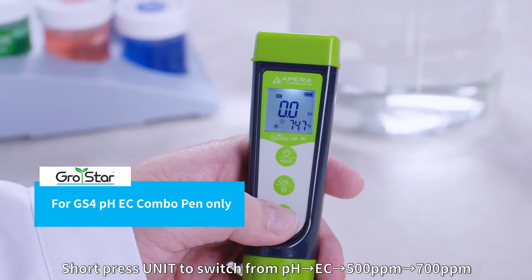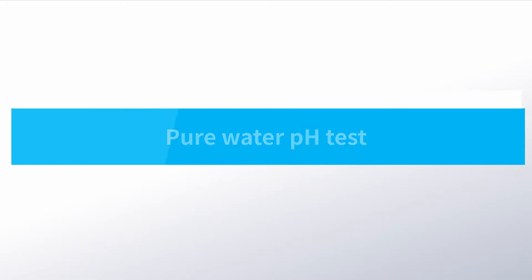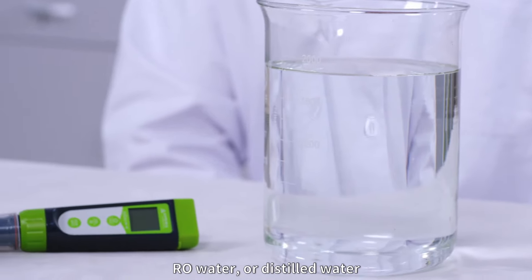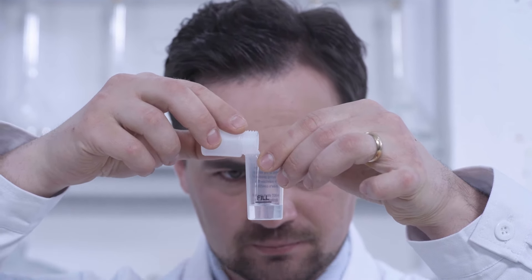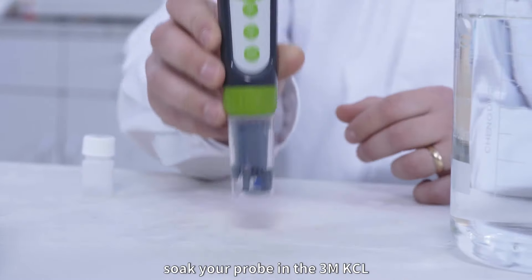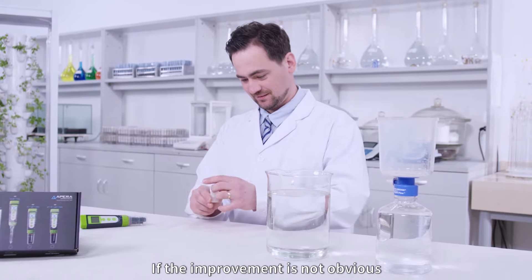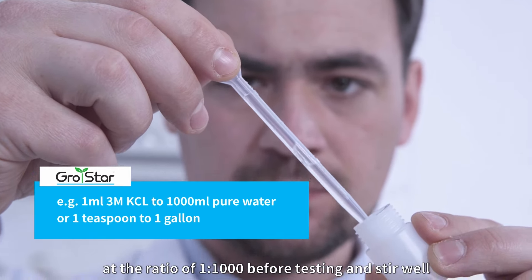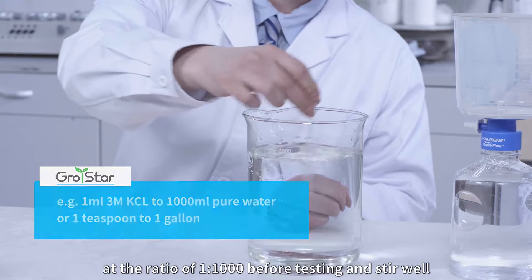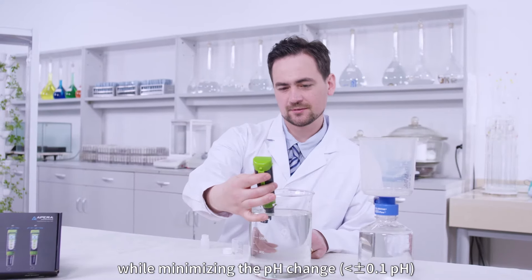Short press Unit to switch from pH, EC, 500 ppm, or 700 ppm. Pure water pH test: to test the pH of pure water like tap water, RO water, or distilled water, the stabilization will take longer than usual. To speed up the stabilization, soak your probe in the 3M KCL soaking solution for 15 minutes before testing. If the improvement is not obvious, add the 3M KCL to pure water at the ratio of 1 to 1000 before testing and stir well. This will significantly speed up the stabilization process while minimizing the pH change — less than 0.1 pH.